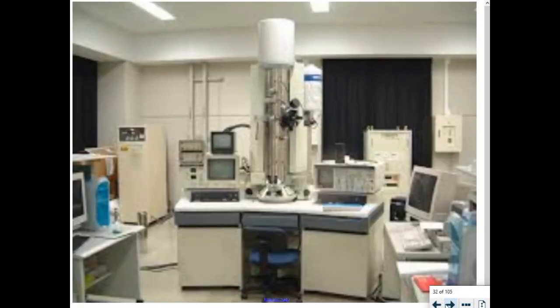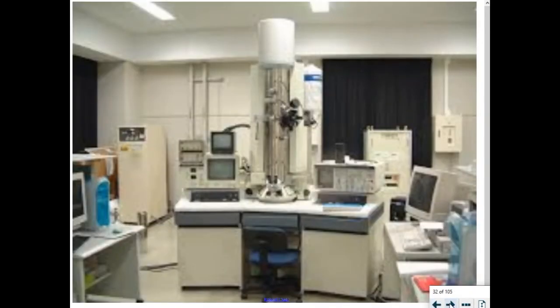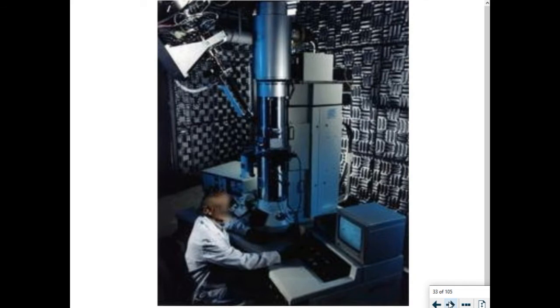Here, let's talk about these slides right here. This right here is one picture of an electron microscope. And this one right here is a second picture of an electron microscope. And the reason I put two of them in here is just to discuss the concept of resolution. I found two pictures on the internet. Which one of these pictures, here's one, and here's two, which of these pictures do you think has better resolution?